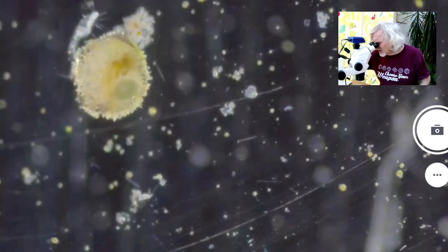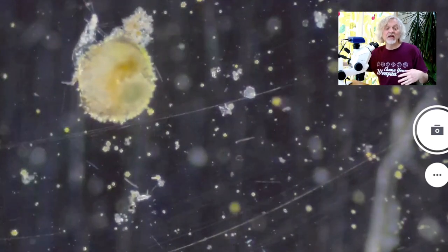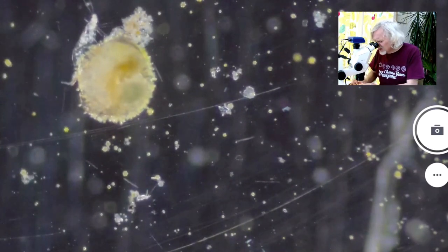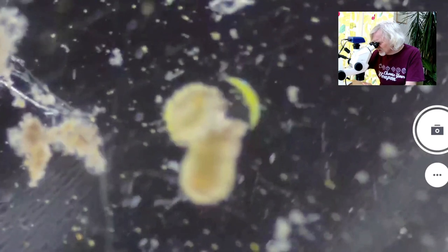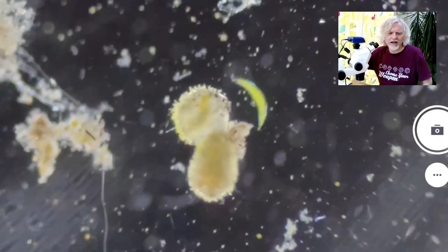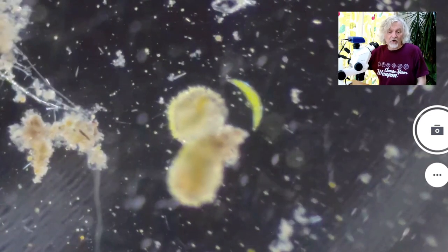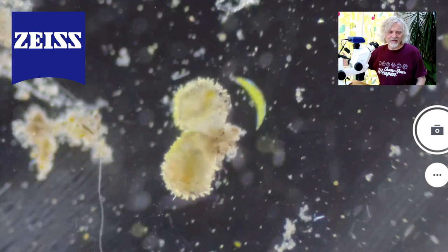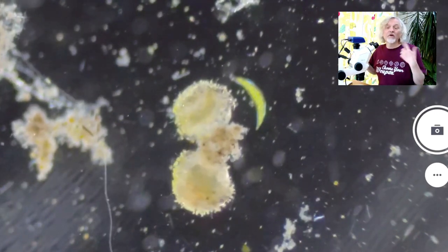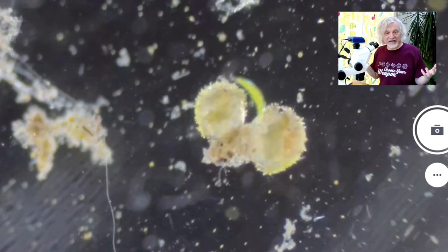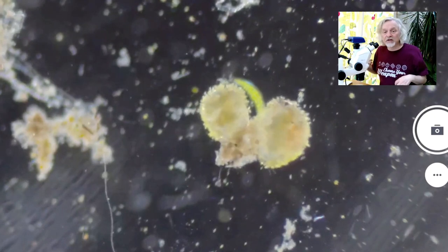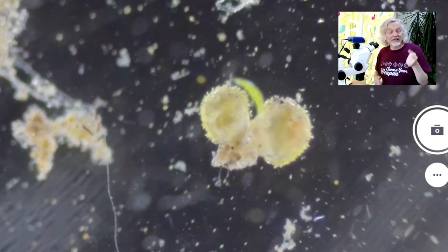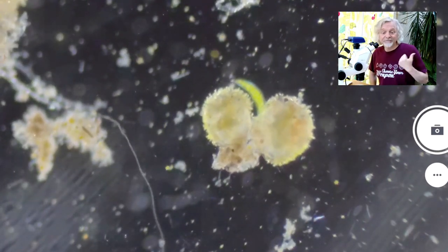And I particularly like, let me just zoom out. Let's see what else we can see. Look, there's a couple of them there. Because the other thing, it shows up rather nicely is some other types of creatures, like, for example, that little green banana there, which I will come to on another episode. That's all I wanted to talk about today. Thanks. Always go to Zeiss for helping me out and do this. There's a couple of little hairy ostracods for you. Do follow along. There's now, I'm getting quite a back catalogue of these things. So you can go onto my YouTube site or you can just filter through on Twitter and come back on, let's see what day is, it's Wednesday today. So come back on Friday and we'll have a look at something else. Cheers. Bye bye.